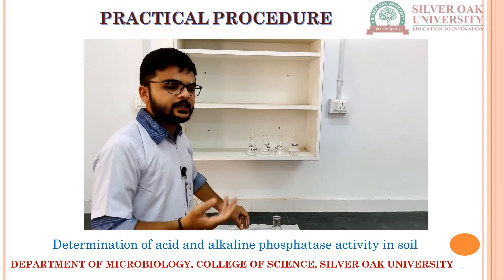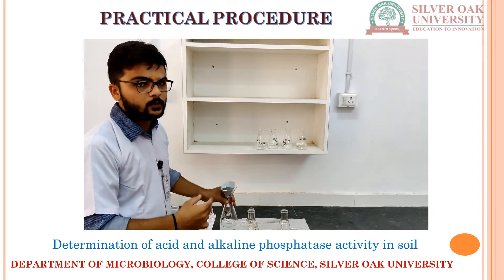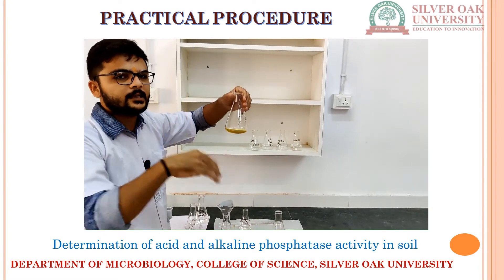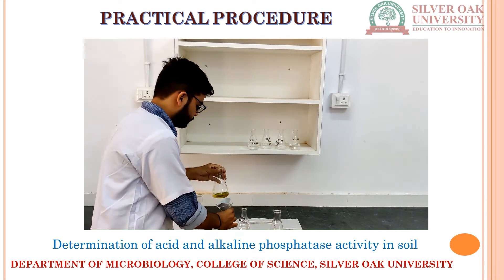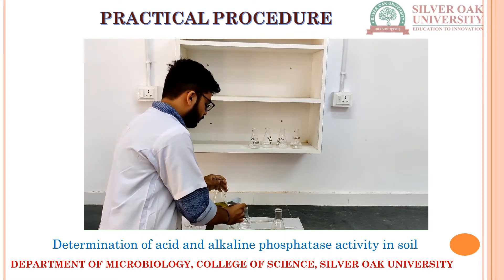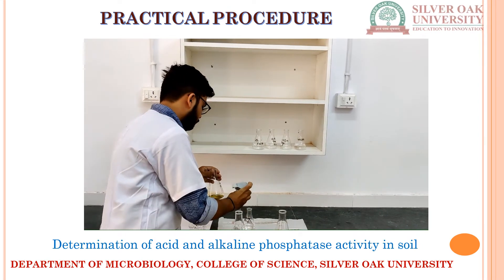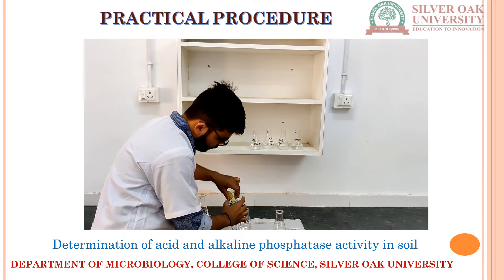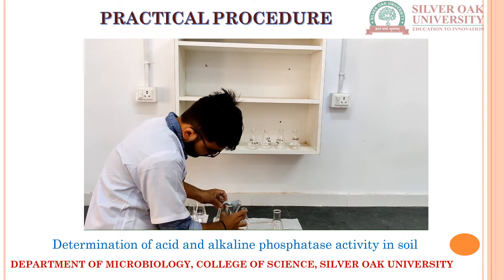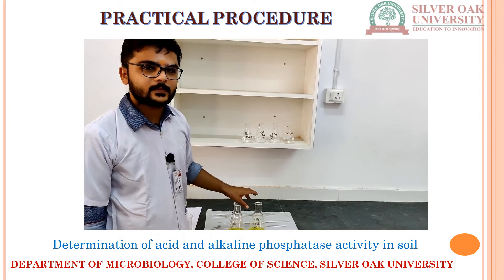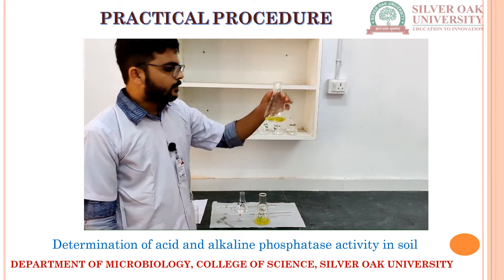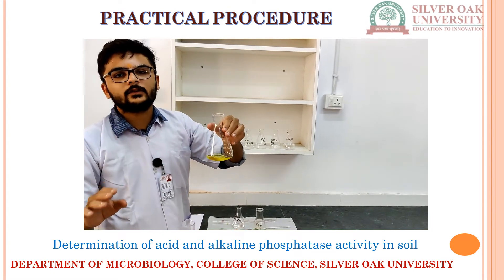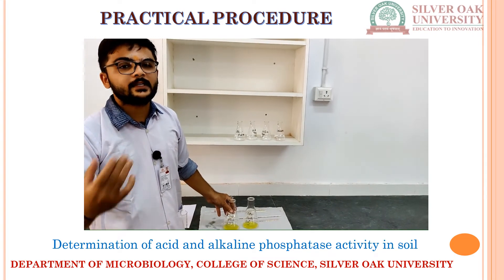Just as you add NaOH, the whole solution will turn yellow in color. After this, we have to filter the whole system through filter paper so that the excess soil particles can be removed and the remaining solution can be studied under the spectrophotometer. For filtering, you take a wet filter paper in your funnel and filter the whole suspension into a flask. After filtration, we will get a yellow colored filtrate.